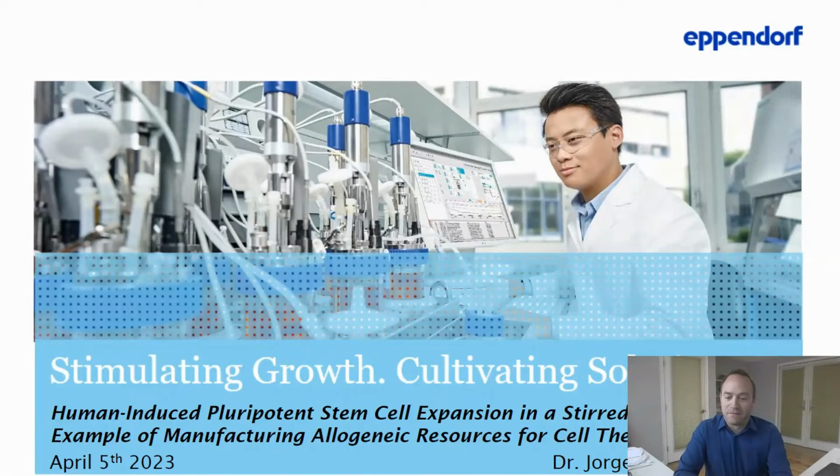Thank you for this kind introduction. It's a great pleasure for me today to talk to the audience and explain the platform we have developed for human-induced pluripotent stem cells and expansion in a stirred 3D system as a perfect example for allogeneic cell therapy applications.